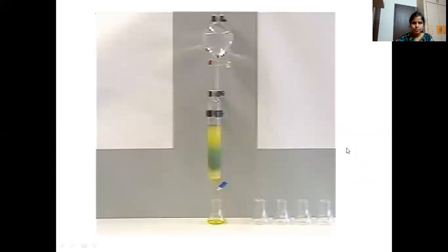Now this is the experimental setup we use in the lab. This is the column, which has a nozzle and a stopcock. All the conical flasks are kept ready. The column is filled with the adsorbent, and this is the mobile phase which we have taken in the dropping funnel.